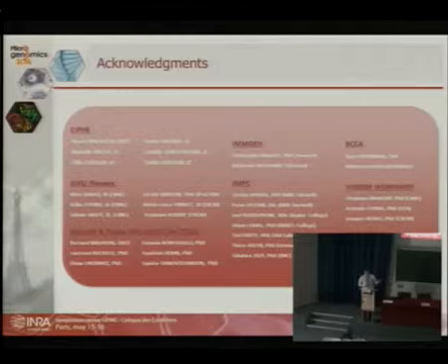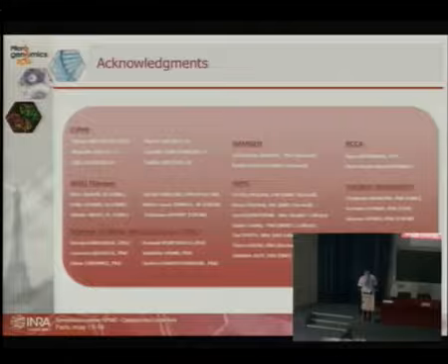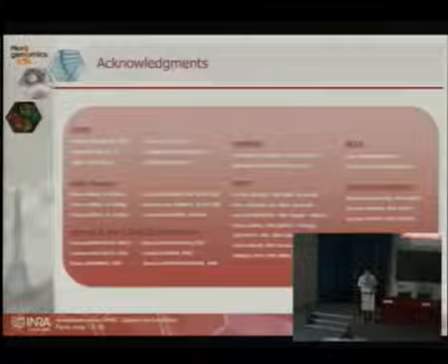What I could see on the fly over the time of cell sorting is that my cells were getting activated and were joining the next stage of development. So if it's not cooled, you have these very big issues. But if you keep it cool, not so much, because we then got this cooling system. We did the cell sorting of our populations and the transcriptomic studies, and we had very clear signatures.